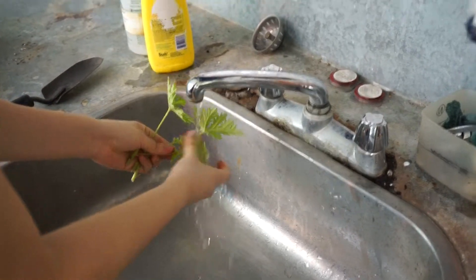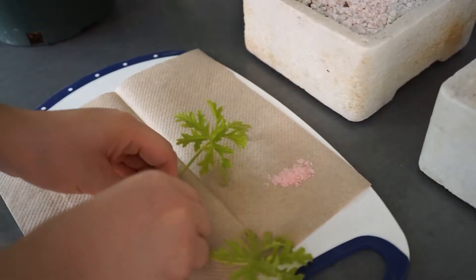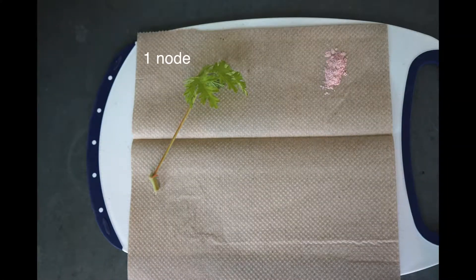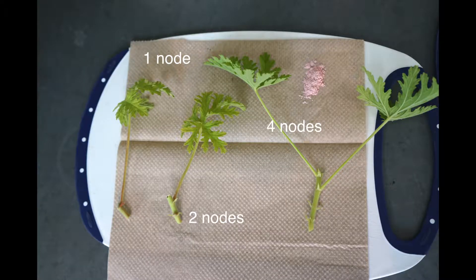Rinse the stem cutting thoroughly with water to reduce dirt and microorganisms on the leaf surface. For 1-node and 2-node cuttings, keep only one leaf per cut. Ten of each — 1-node, 2-node, and 4-node cuttings — were made in this experiment.